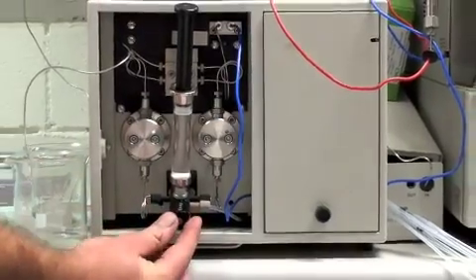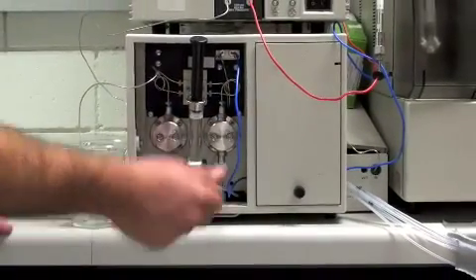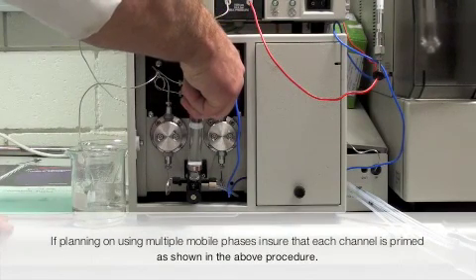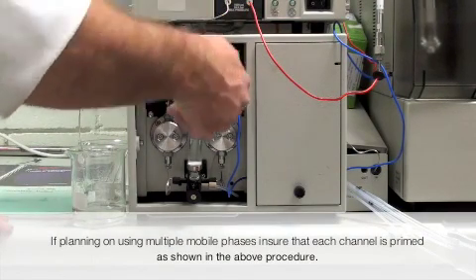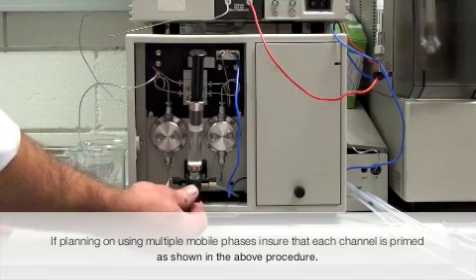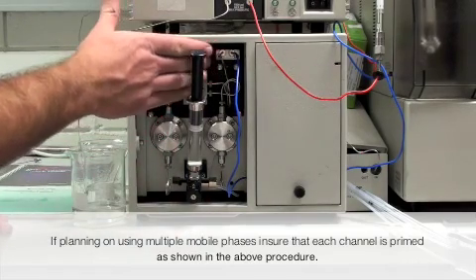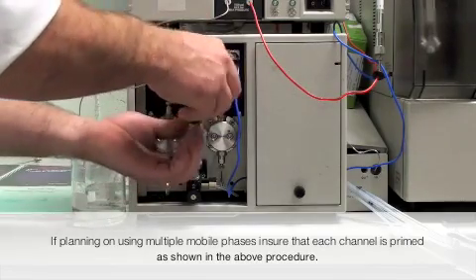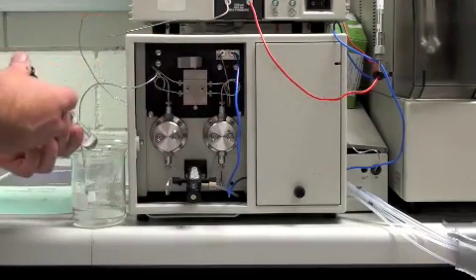You then turn this switch to the inject position, and inject a small amount of the solution back through the pump. After this, you then put this to the run position, you move this valve to the left, you've now primed your pump, and the solution is now running through the column.